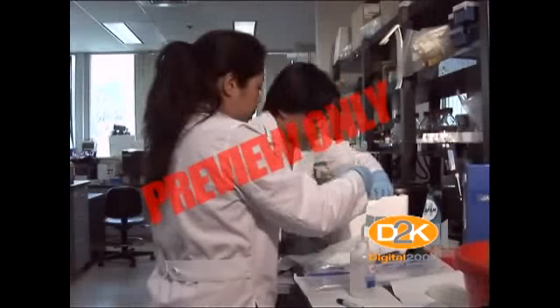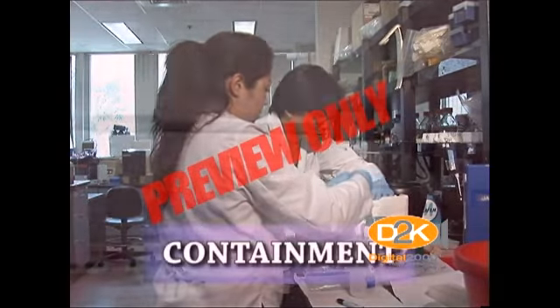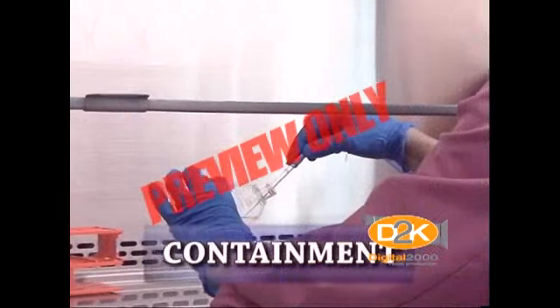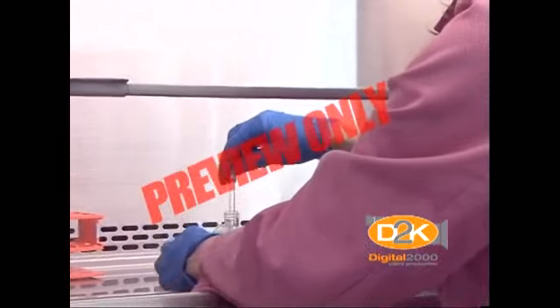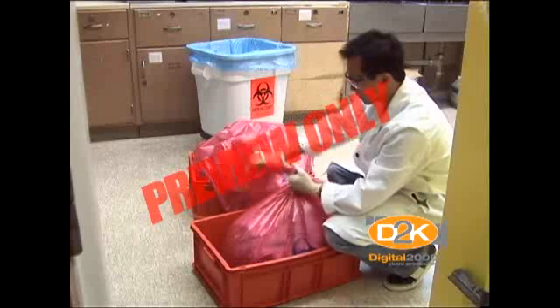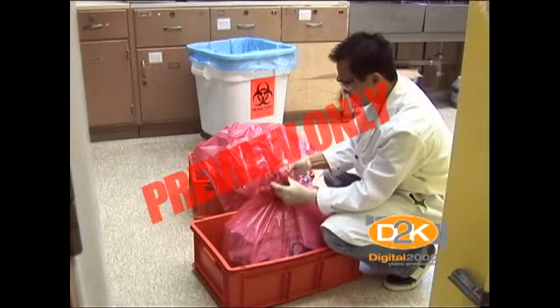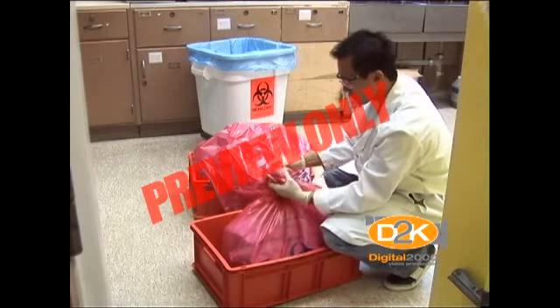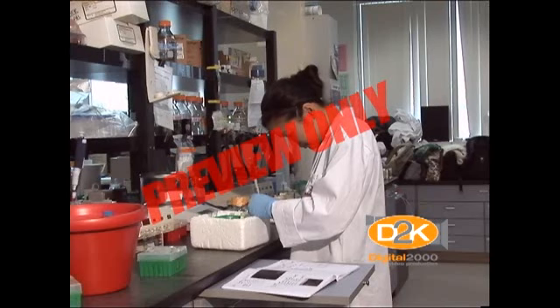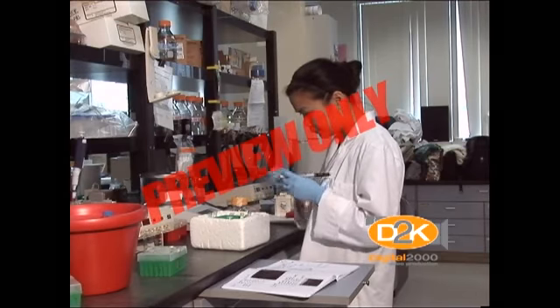The primary principle of biological safety or biosafety is containment. The term containment refers to a series of safe methods for managing infectious agents in the laboratory. The purpose of containment is to reduce or eliminate human and environmental exposure to potentially harmful agents. Primary containment protects students, laboratory staff, and professors and the immediate laboratory environment from exposure to infectious agents.